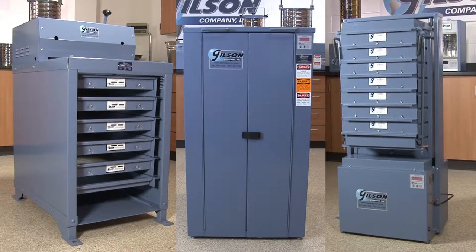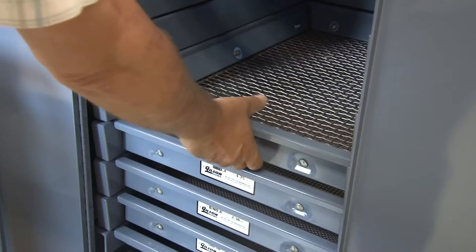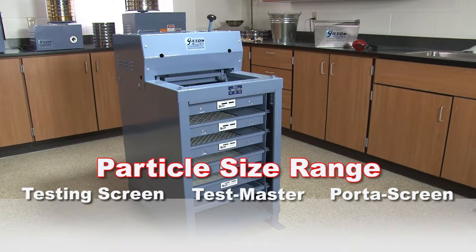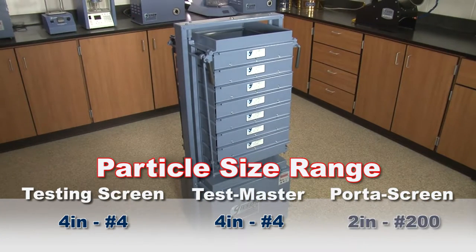Let's compare the different screening units so you can decide which unit best matches your needs for accurate particle size determinations. Vibration and amplitude characteristics of the testing screen and Testmaster are identical and are optimized for effective particle size determinations in the four inch to number four size range, whereas the Porta screens are optimized for particle size determinations within the two inch to number two hundred size range.